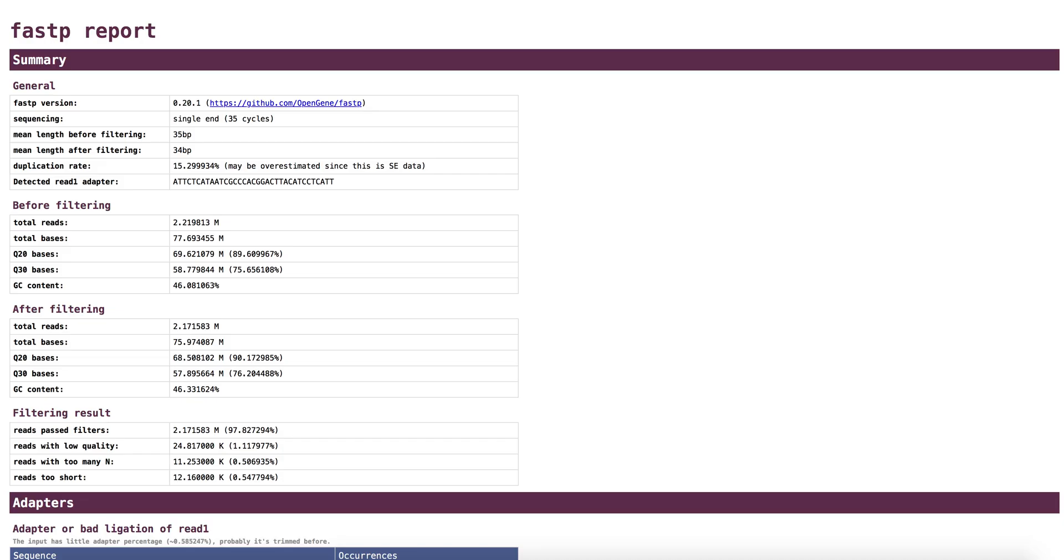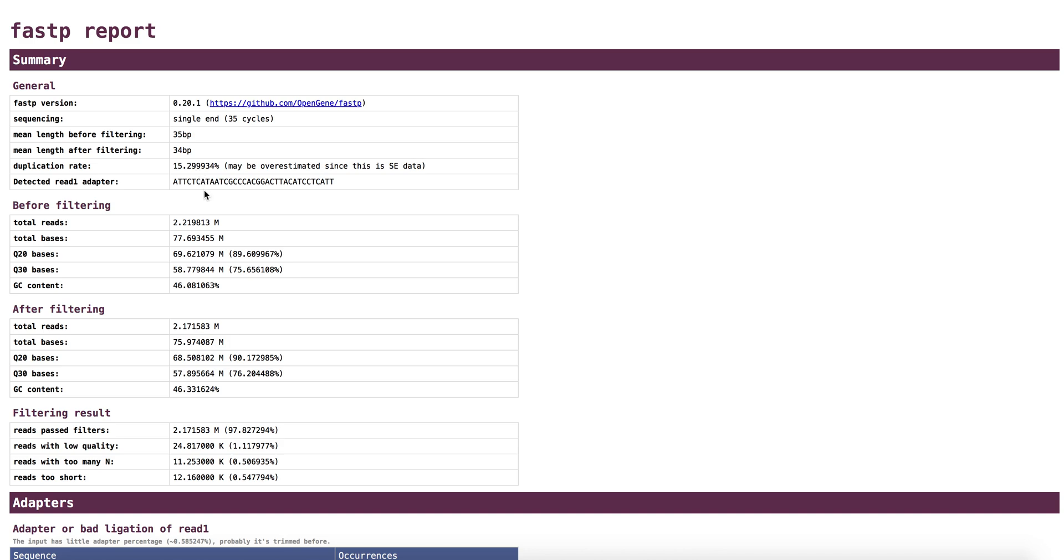Now we'll go through an example of a FASTP report. It's not for the file that we just generated, but it's a similar kind of sample. It's from a single-end sequencing platform that utilized reads of length 35. You can see here it provides what was the mean length before and after filtering. Typically, that doesn't change by much, one or two base pairs. The duplication rate, which is essentially estimating what percentage of the reads are not unique. And then, what does it detect for the adapters, potential adapters.